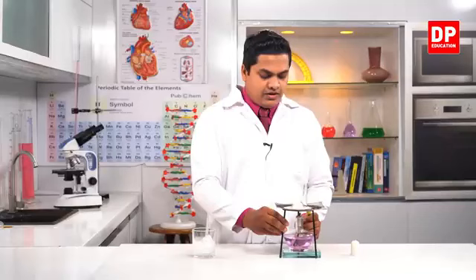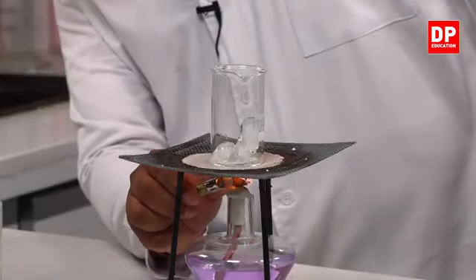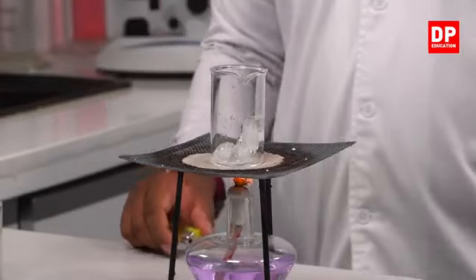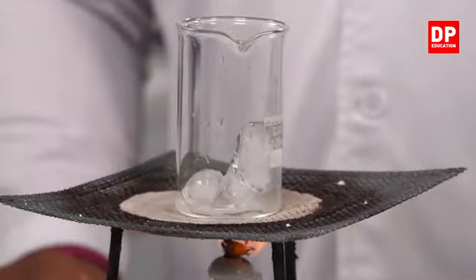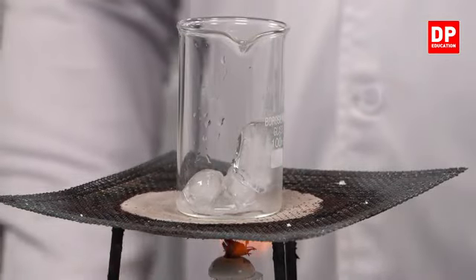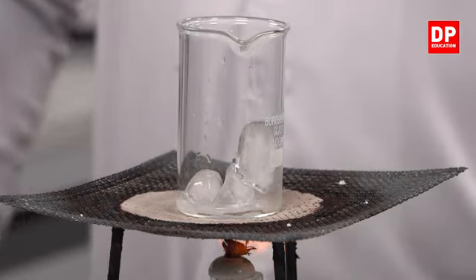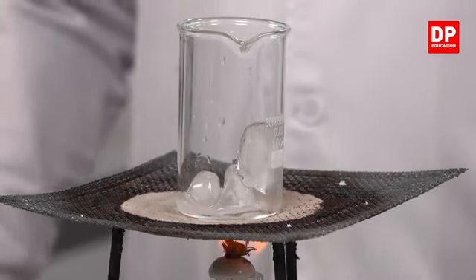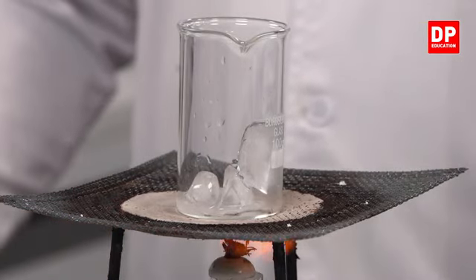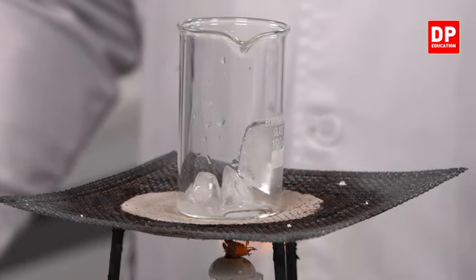Right. Now what I'm going to do is supply heat by using the spirit lamp and heat this thing up. So when supplying heat gradually to the beaker, this means ice will turn into a liquid. Right? Ice will turn into a liquid. Now in the earlier case, you observed that the solid wax also turned into liquid wax. Now in this case, solid ice cubes are turning into liquid water.